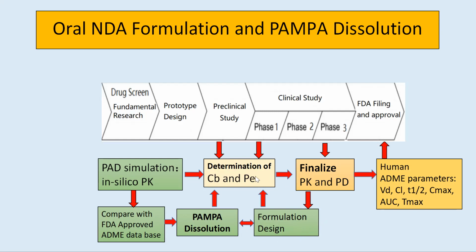Then with that, you can proceed to phase 1. And through phase 1 and phase 2, you can also make modifications to your formulation and end up with the final PK and PD. So after approval, these ADME data can really feed back to your ADME database again, right? This process helps us a lot in terms of using the database plus PAMPA dissolution.